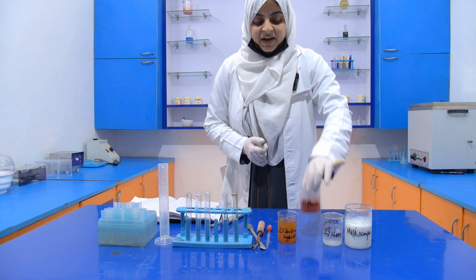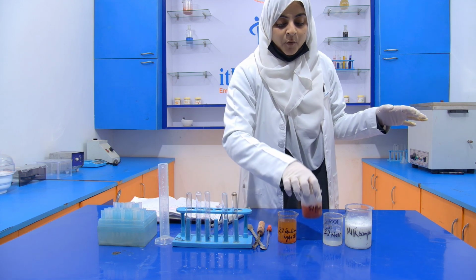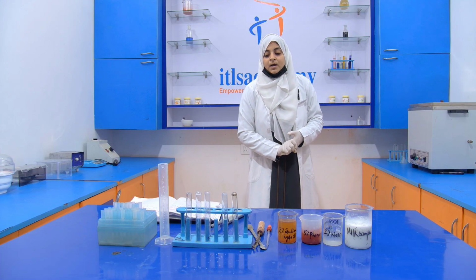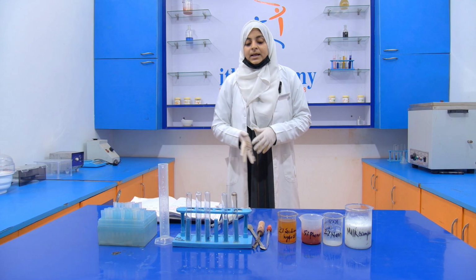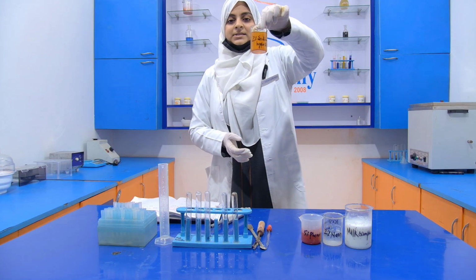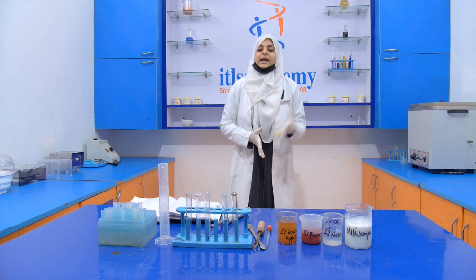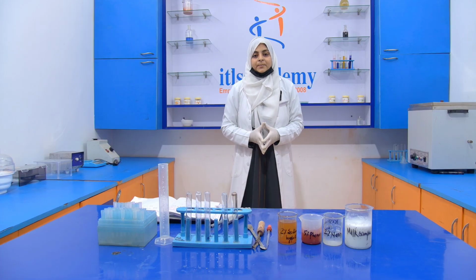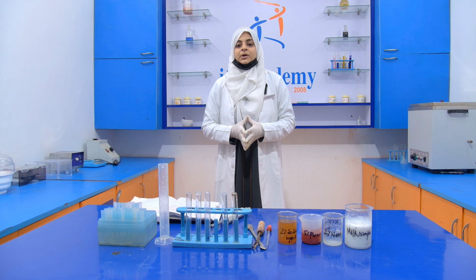Then we prepare 5% phenol. For the preparation of 5% phenol, we require 5 gram of phenol, which will be dissolved in 100 ml of distilled water. Then the last is the 2% sodium hypochlorite solution. Again, we take 2 gram of sodium hypochlorite, and it will be dissolved in 100 ml of distilled water. This is how we prepare all these reagents.